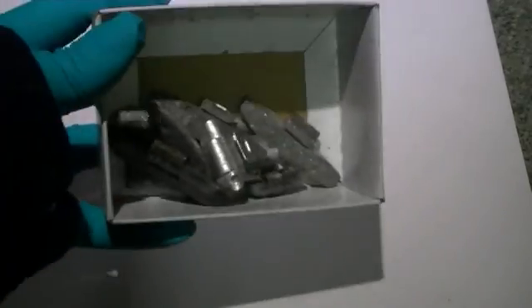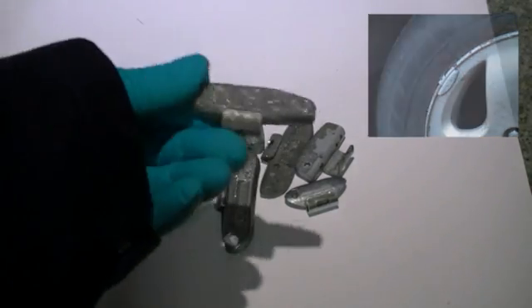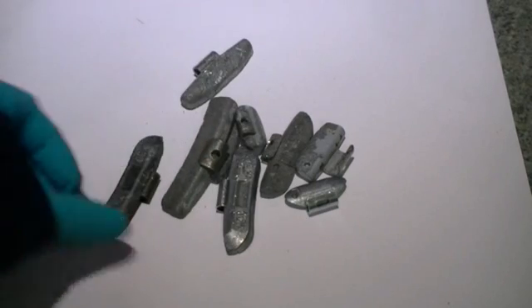The metallic zinc we've harvested from some scrap wheel balancing weights used on cars. Within these weights there is a small steel tab used to secure them to the car wheel, and we've removed this using a hacksaw.